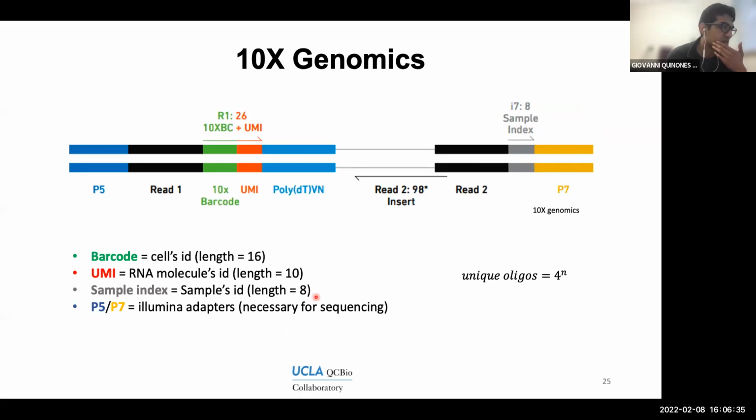Sample in this case, of course, would be defined based on your experimental design. Maybe you have single cells from person 1, so that will be one sample versus single cells of person number 2. Yeah, so it's just an extra sample that you are incorporating into your long construct.